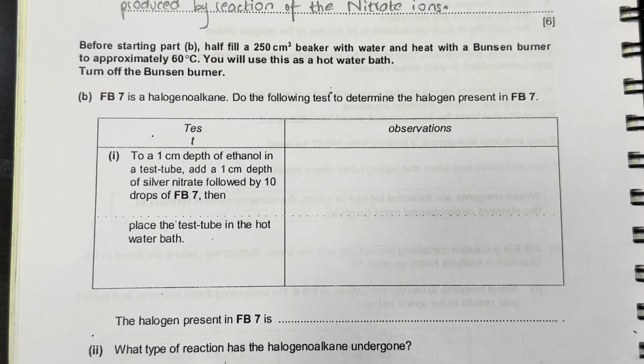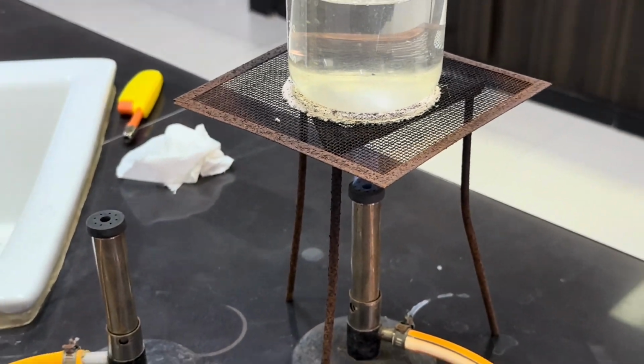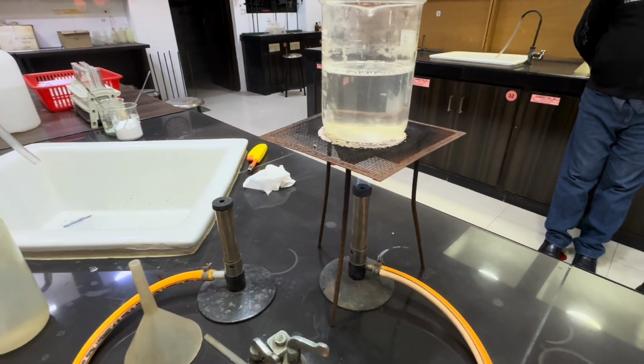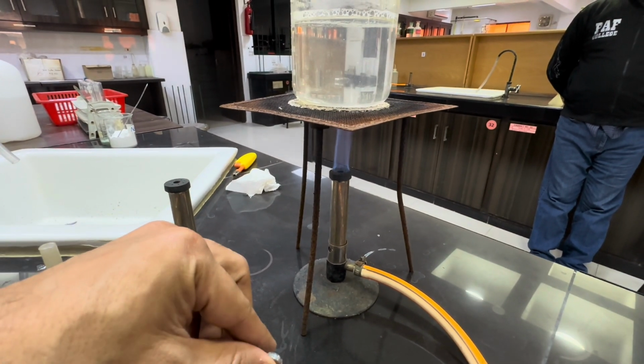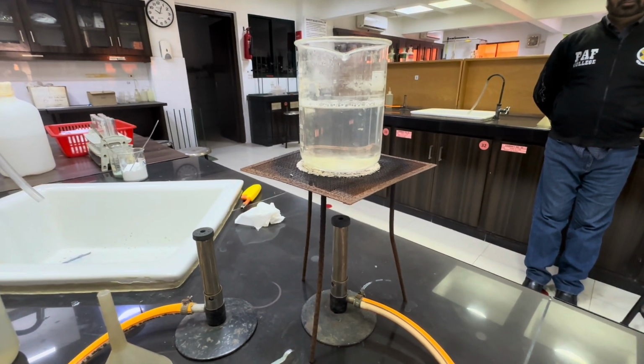Turn off the Bunsen burner. Now, I have kept here a beaker in which water is warmed, and we can see it's here. And now we will switch off this burner. We will just use this hot water for the tests.